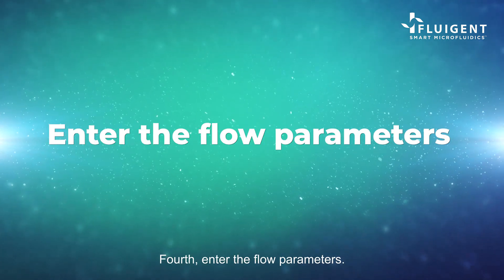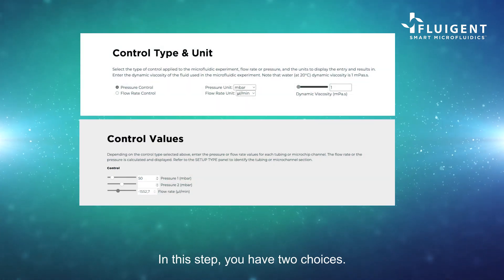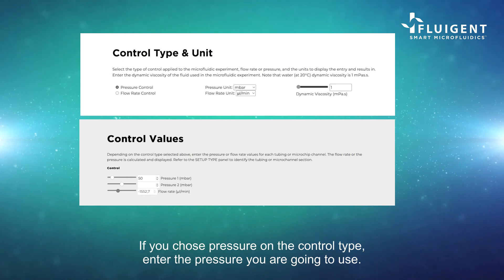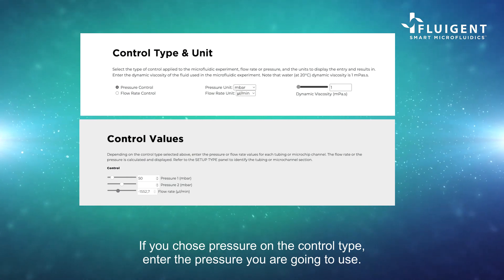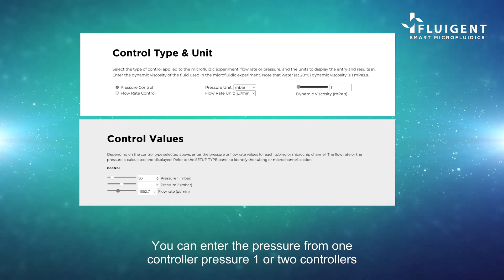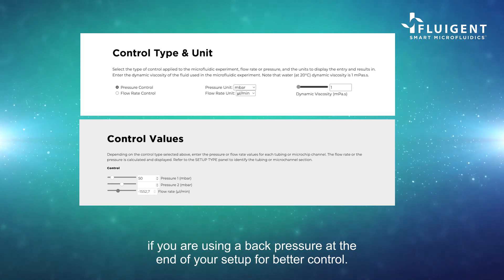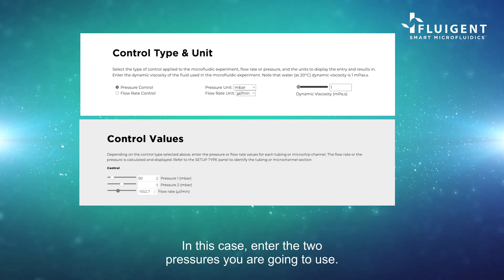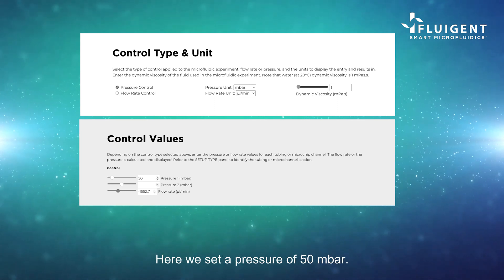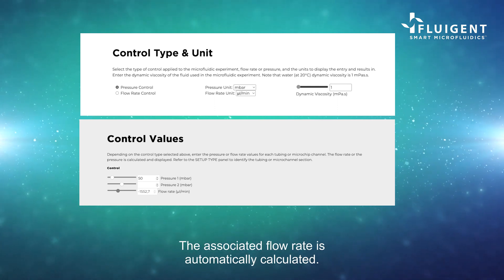Fourth, enter the flow parameters. In this step, you have two choices. If you chose pressure on the control type, enter the pressure you are going to use. You can enter the pressure from one controller, pressure one, or two controllers if you are using a back pressure at the end of your setup for better control. In this case, enter the two pressures you are going to use. Here, we set a pressure of 15 mbar. The associated flow rate is automatically calculated.